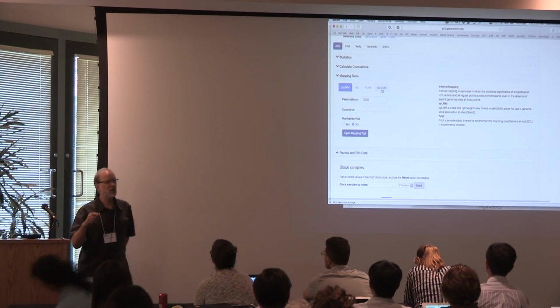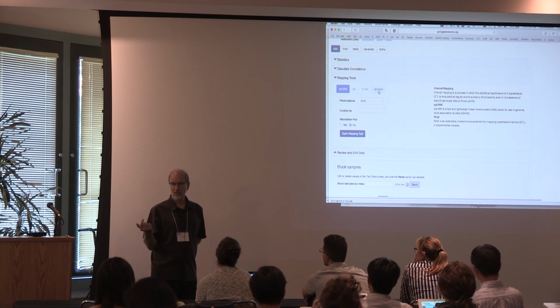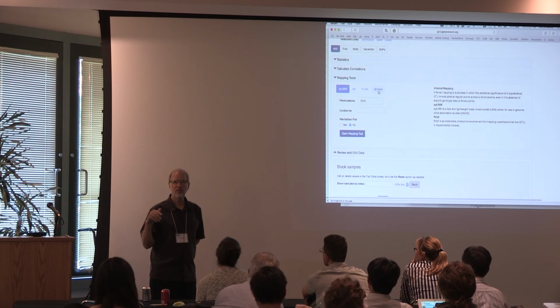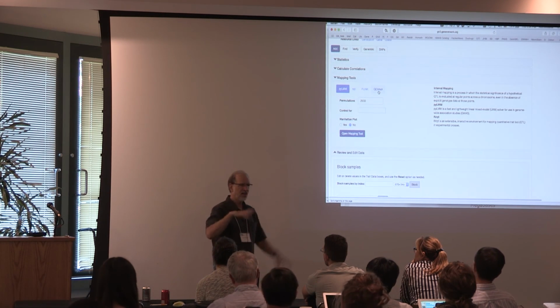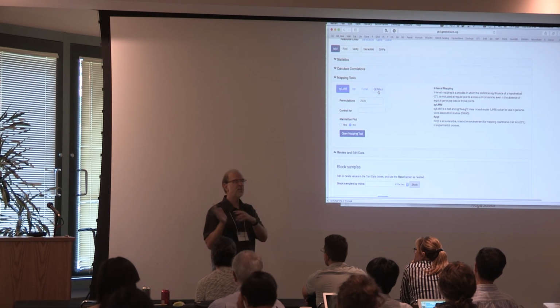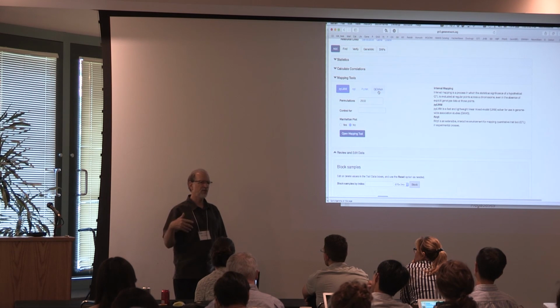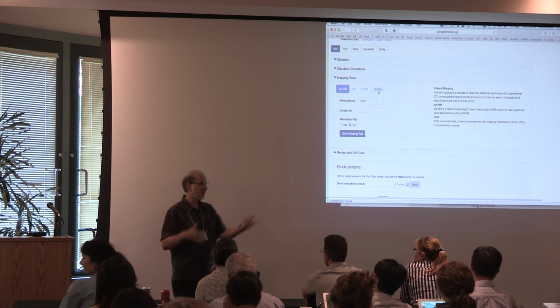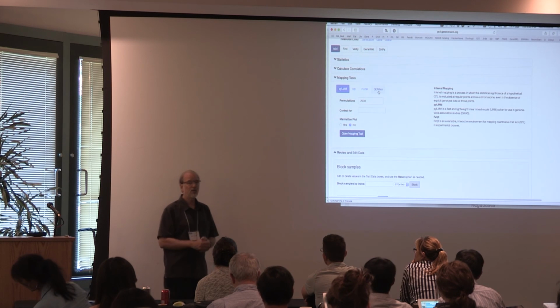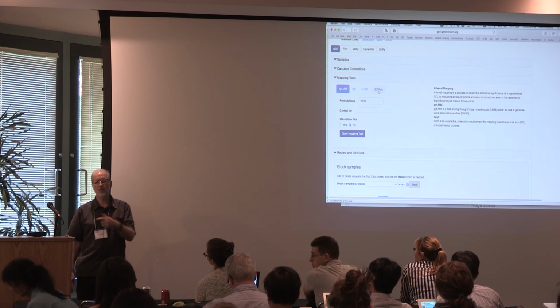So, yeah, play around with GeneNetwork. If you have specific questions or things you want me to do, I'm happy to do homework for you or work with you tomorrow or even tonight. Or send me an email and say, I'm interested in this trait, where's the best data? Because one of the things I didn't tell you is, how do you find data that's relevant for your problem? Maybe you want high-fat, low-fat diet, or maybe you want a neurodegeneration data set that's young and old, like we heard about for Huntington's. Probably 50% of the time, we will have something that's relevant for you in GeneNetwork.